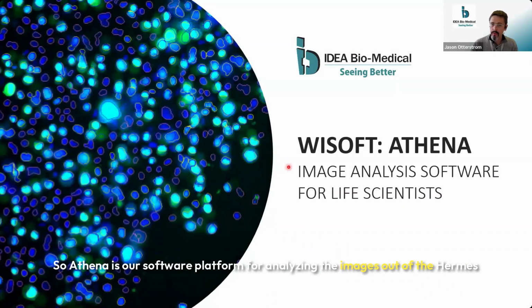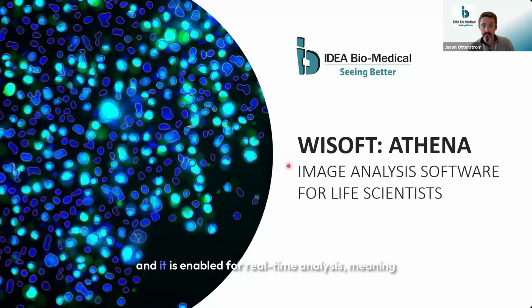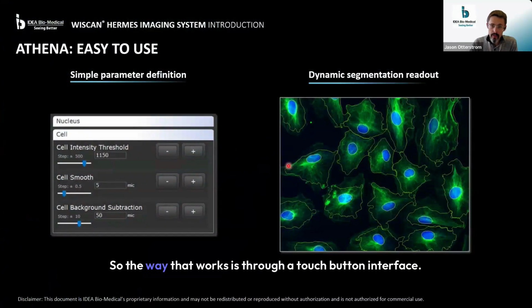So Athena is our software platform for analyzing the images out of the Hermes, and it is enabled for real-time analysis, meaning that as the images are being acquired on the Hermes, you can set up Athena to begin analyzing them at the same time. So the way that works is, again, through a touch button interface.